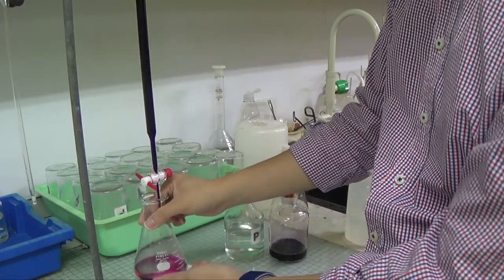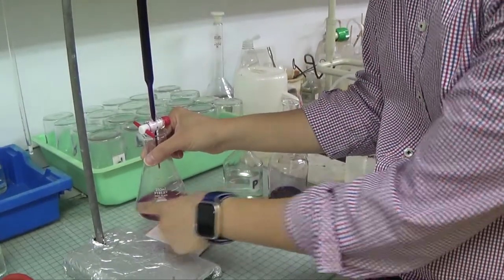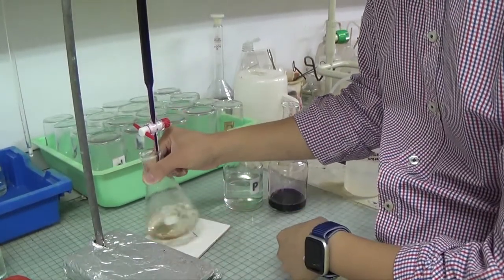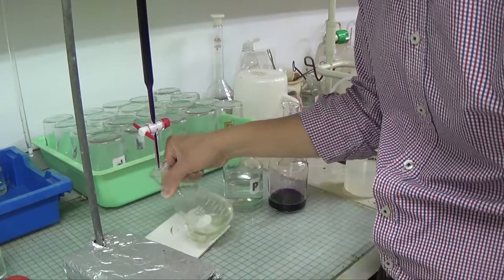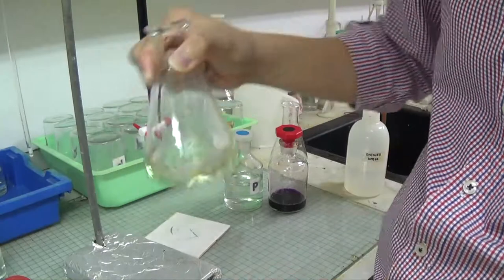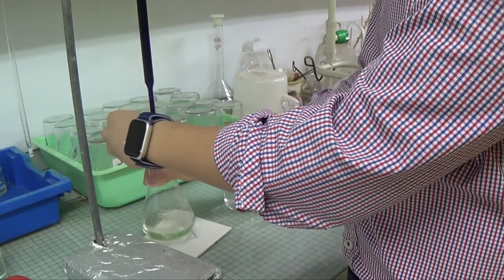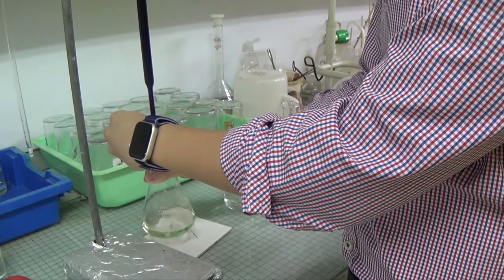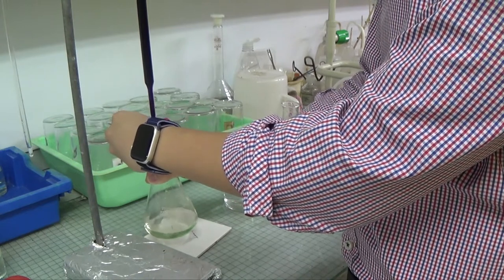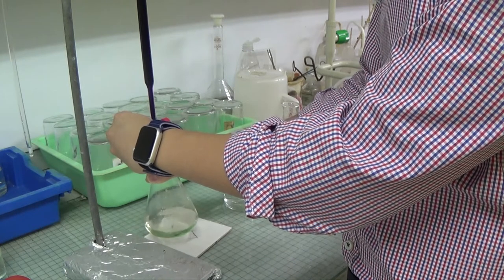So it looks like it's, I'm sorry, it's not very clear. I haven't swirled this at all. It looks like it's pulping, but as you can see, as I swirl it, I haven't reached excess yet. Okay, so this is the moment when I should do it drop by drop, and then one single drop would mean, so adjust your burette so that it goes drop by drop.